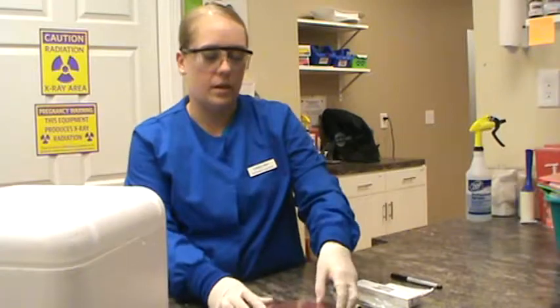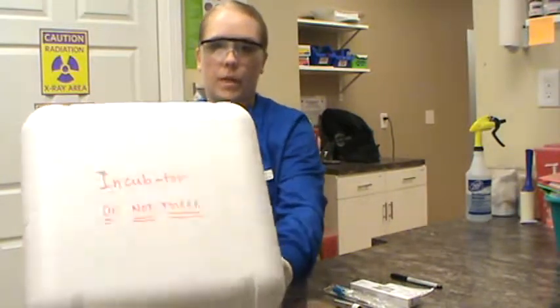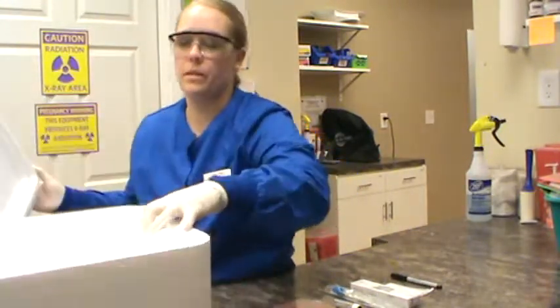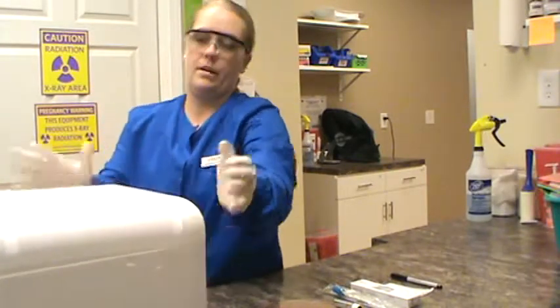So I'm going to zoom in here on our supplies that we have. Here's our incubator, a nice little homemade incubator made out of a styrofoam box, and we're going to set that in the sun. It should come up to an appropriate temperature. We have a little tray down on the bottom for our sample to sit on, and that should work out just fine.